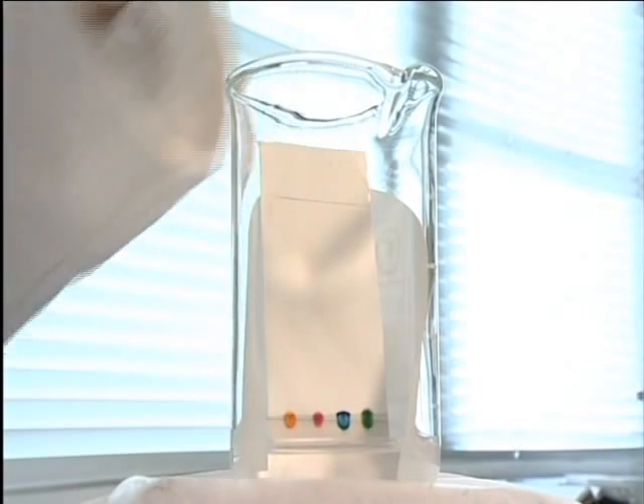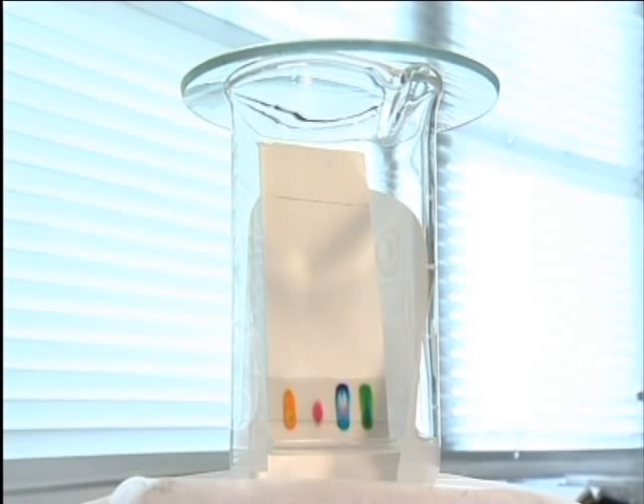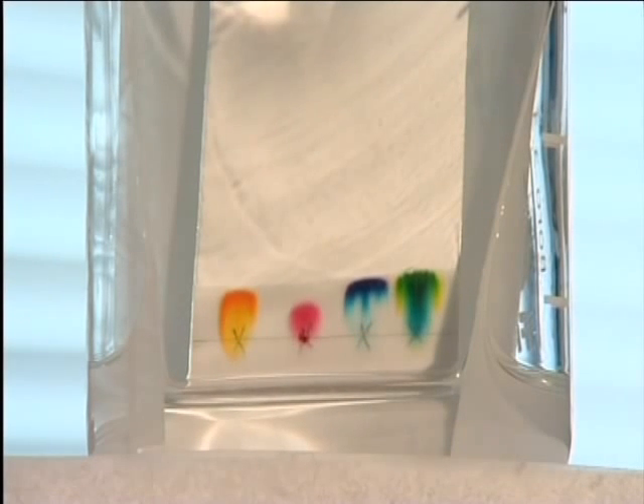HPLC works on the same principle as paper chromatography, here shown speeded up. A liquid, called the mobile phase, moves past a solid, the stationary phase. In paper chromatography, this stationary phase consists of water molecules bound to the cellulose in the paper. The mobile phase carries different components of a mixture, called the sample, along with it at different rates. How fast each one moves depends on its relative affinity for the mobile and the stationary phases.